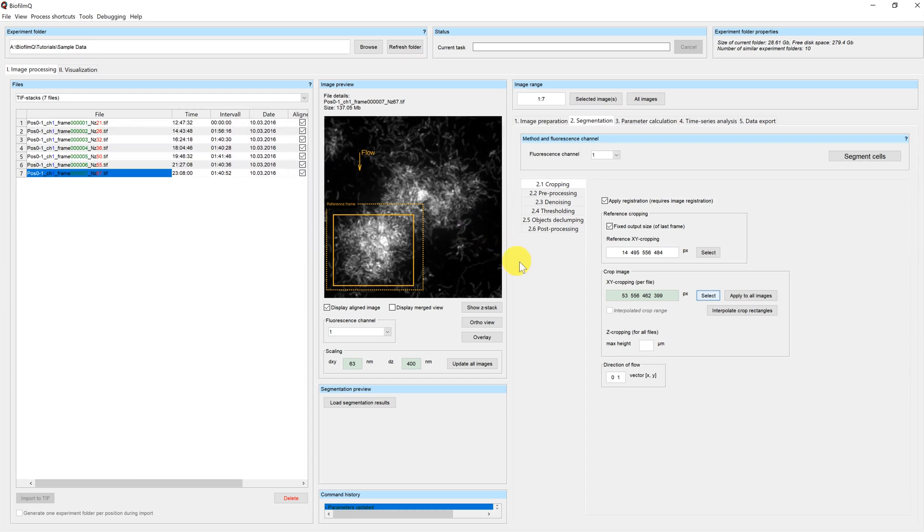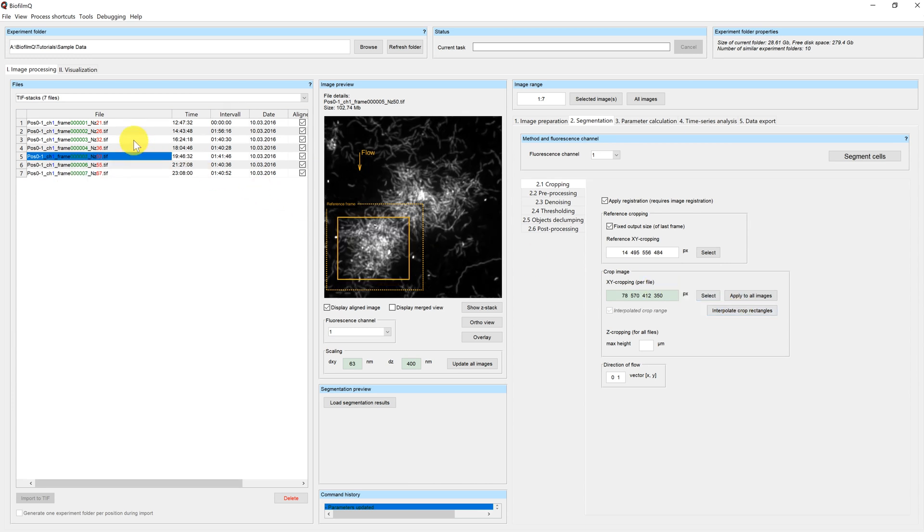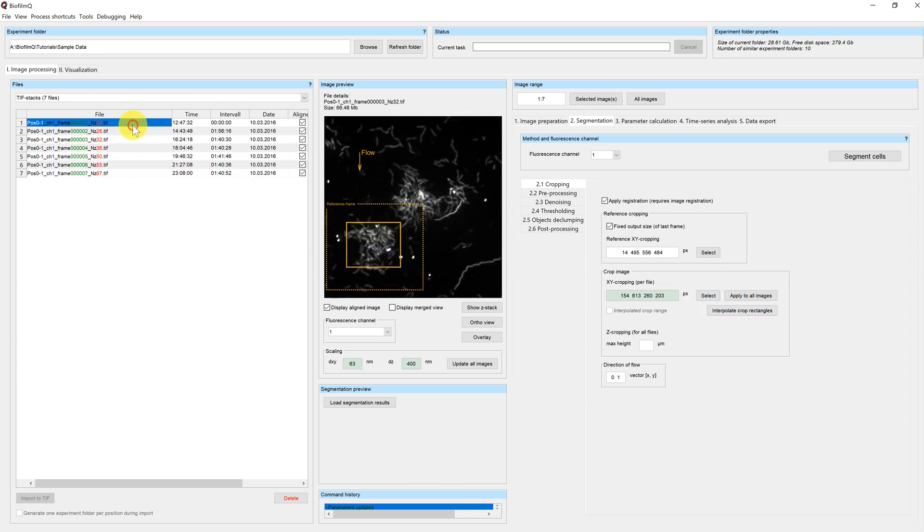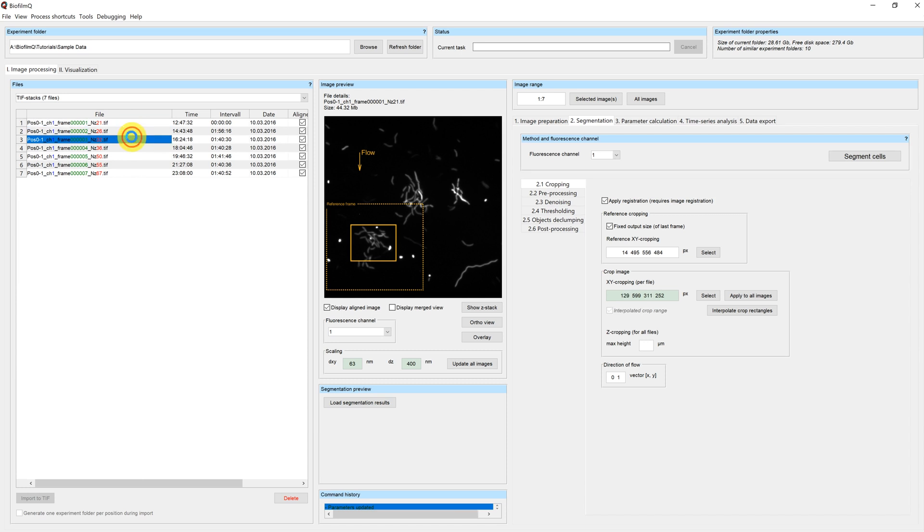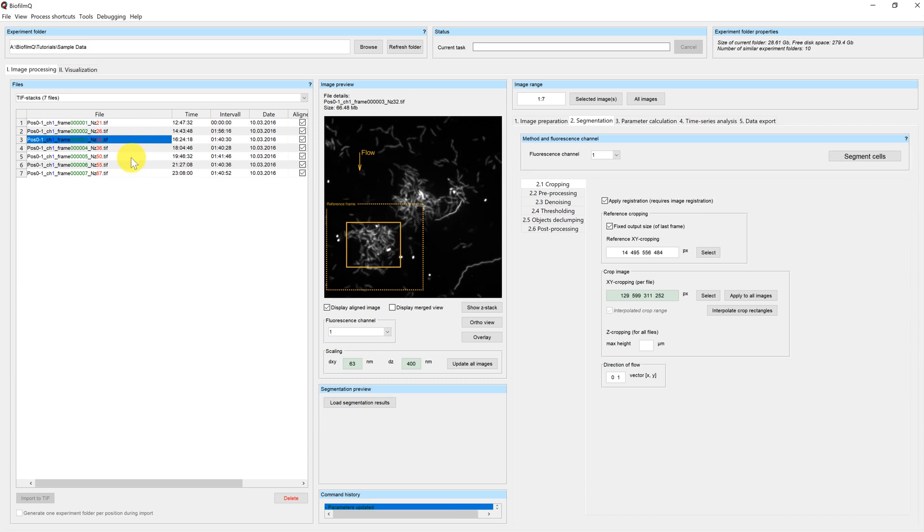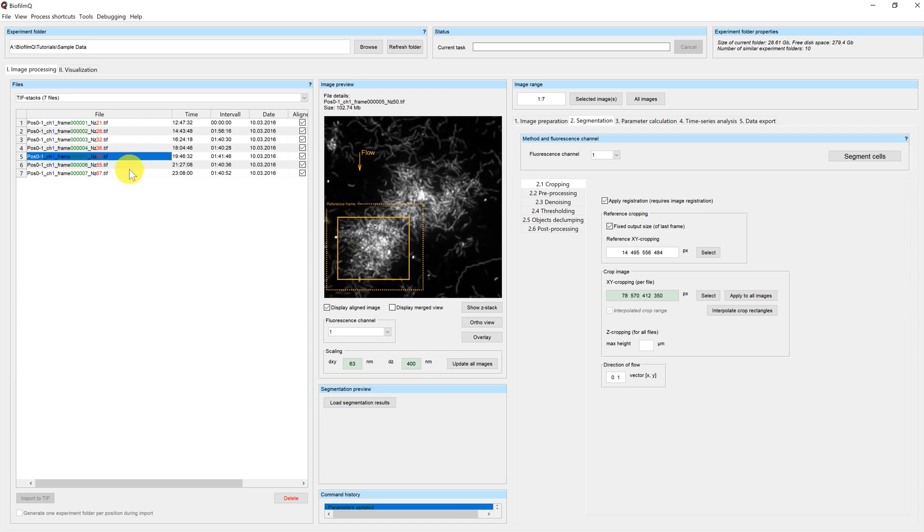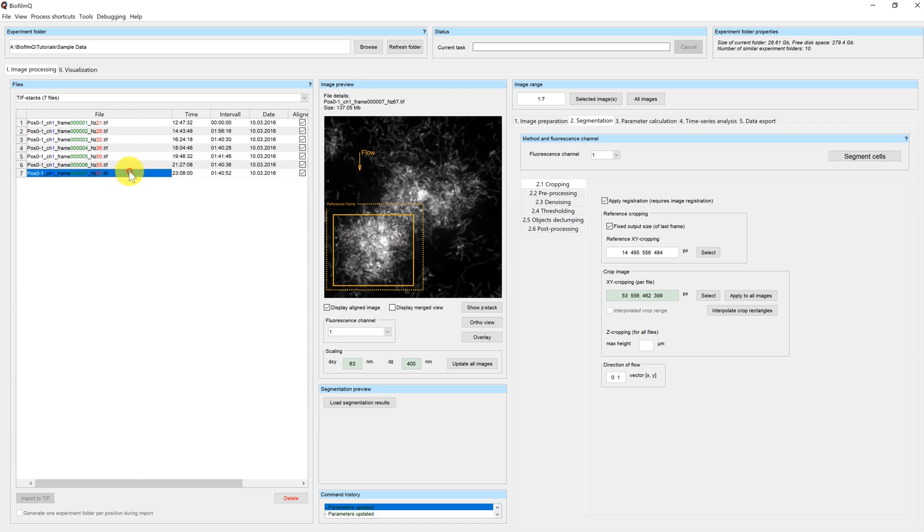And if you click now on interpolate crop rectangles, you can see that the cropping frame has been automatically interpolated and adjusted to your biofilm size.